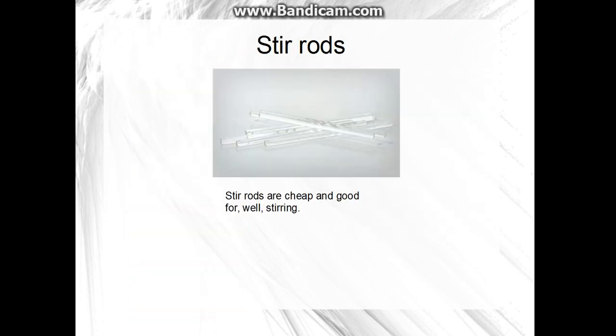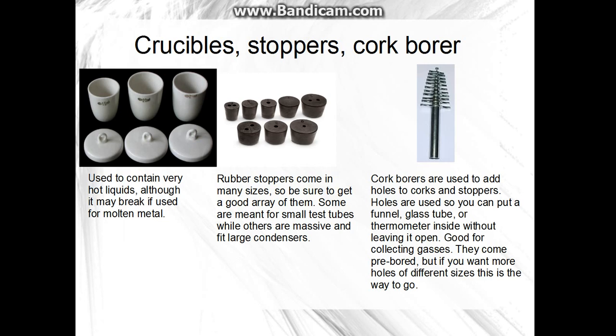You'll need stir rods — they're cheap and used for stirring, obviously. Crucibles, stoppers, and cork borers: I haven't used crucibles very much, but they're used to hold hot liquids or molten material — that's what they're designed for. Rubber stoppers come in many different sizes, and you can buy them pre-bored with holes. Make sure you get ones that fit your glassware. Cork borers are used to add holes if you want a different size — those are good to have.